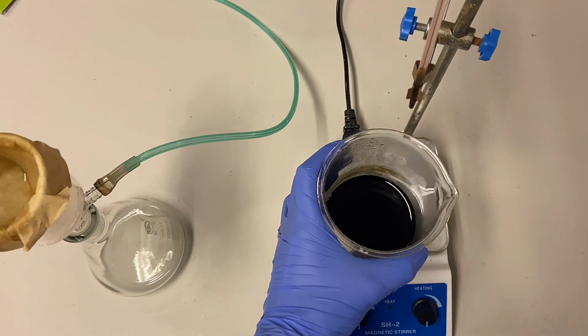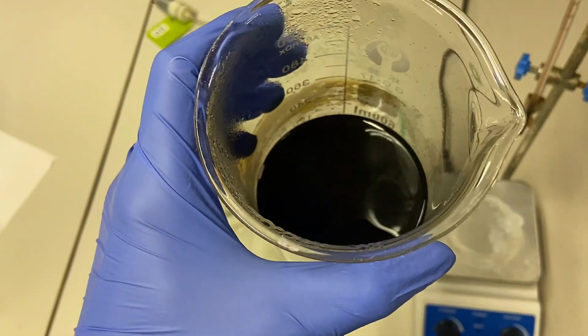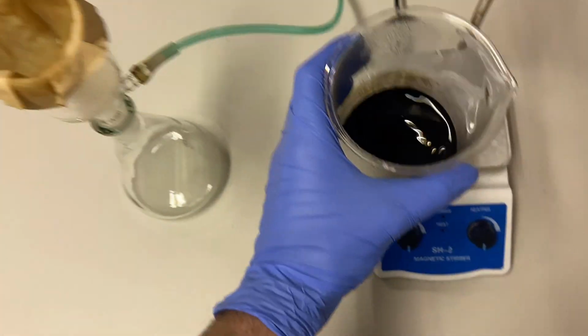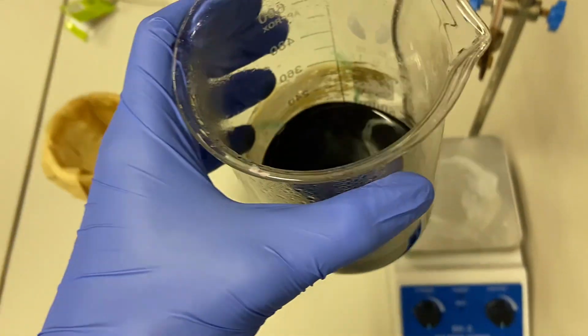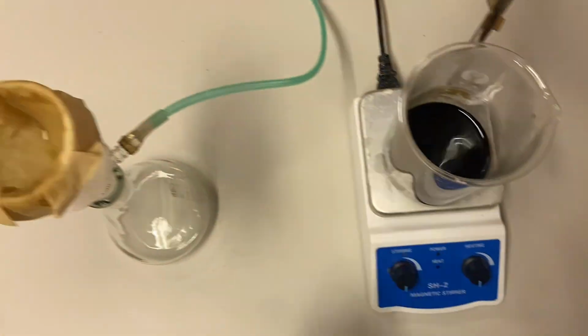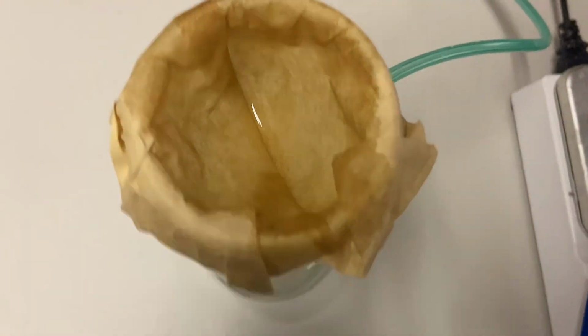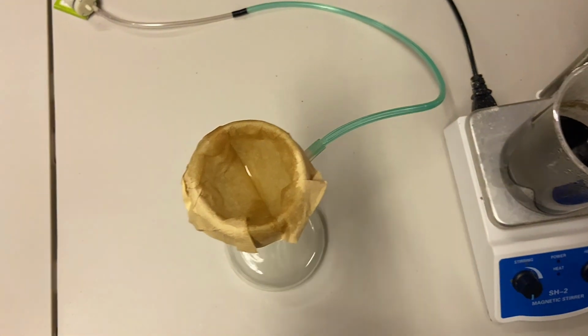Righto, that's all done. It's been a good few hours. You can see that a lot of the water has boiled off, which is hopefully not too bad. It does make the filtering easier. And you can pretty clearly see the solution has turned black because there is a lot of manganese in there, which is to be expected. Now, I've got the vacuum filter set up here, just a normal filter in the bottom and a coffee filter just to make it a little bit easier to get the stuff out.